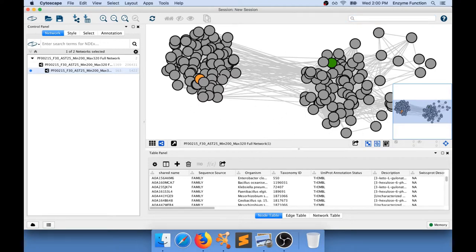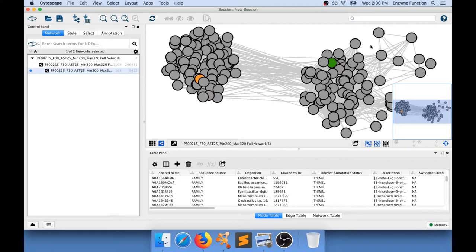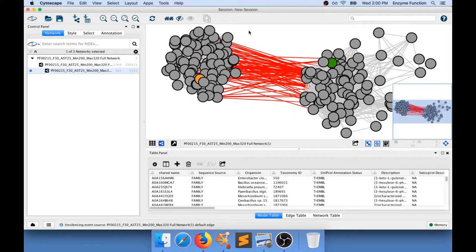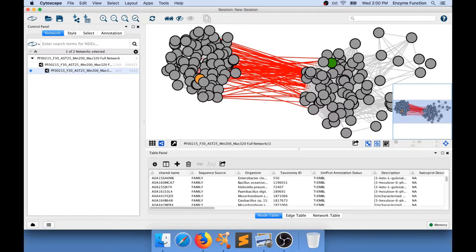So now that I have separated my two different sub-clusters what I'm going to look at is actually the edge values that connect these two sub-clusters. To do that I'm going to hold the shift key on my keyboard and draw a box that goes over all the edges I want to examine. If I do that and release my mouse I'm able to select all the edges that connect these two sub-clusters.